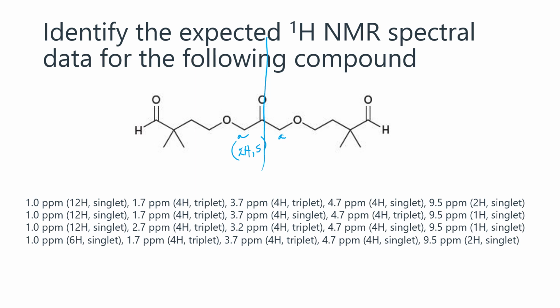Well, 2 H's, no, 4 H's actually, because I'm adding 2 and 2. So that's the signal here, right, is identical to that. So at the end of the day, B is also 4 H's. And they're looking at 2 neighbors here. I'm going to call those C.